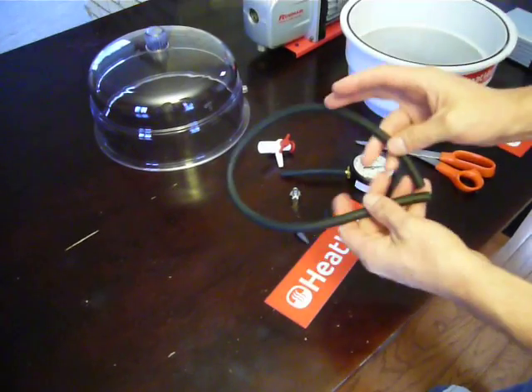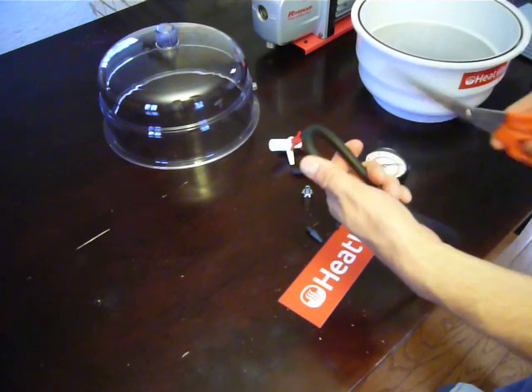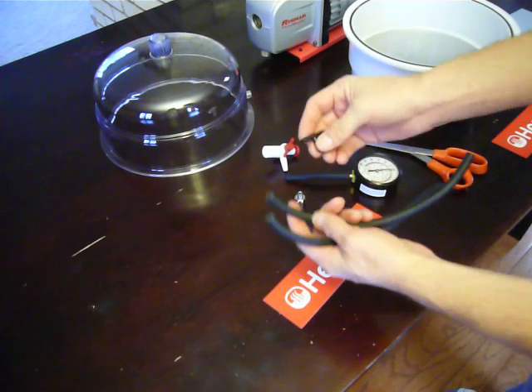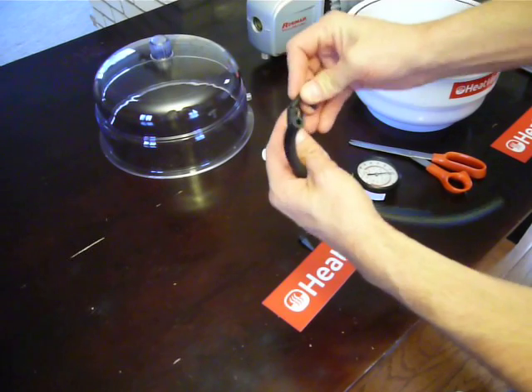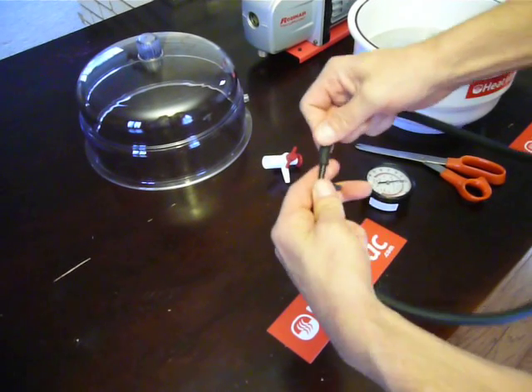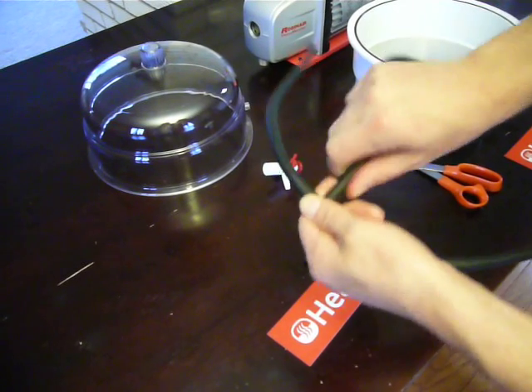Then take the remaining hose, fold it in half to get an equal length, cut it approximately in half, and then you'll take a T-barb — as it's called — one side in here, one side in here, and the pump on the final T.